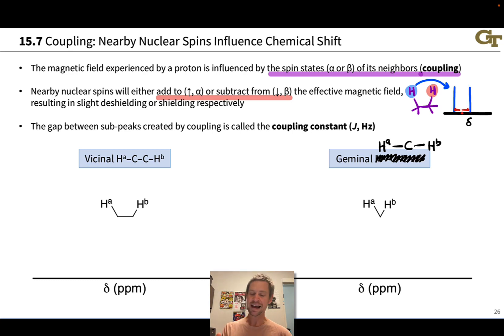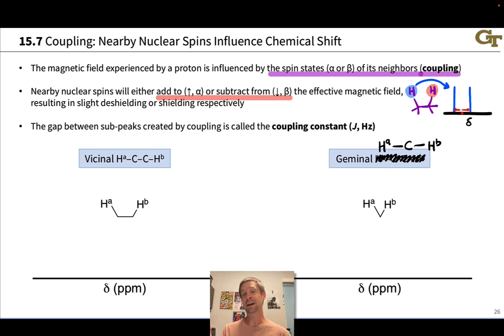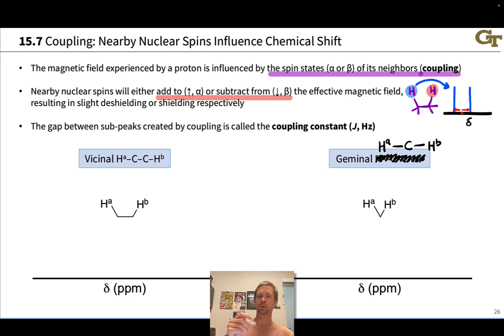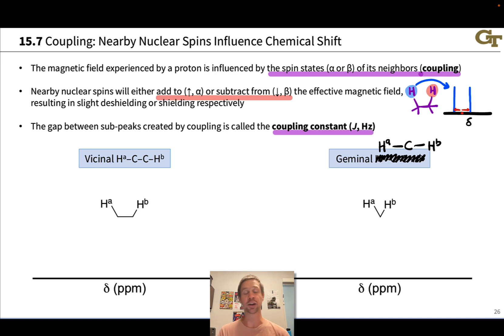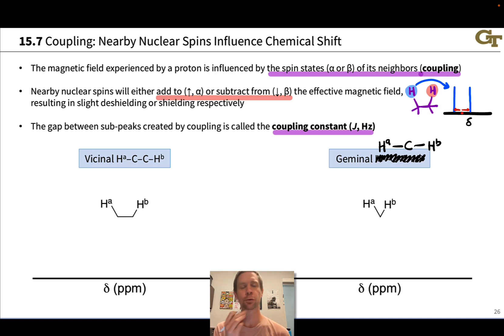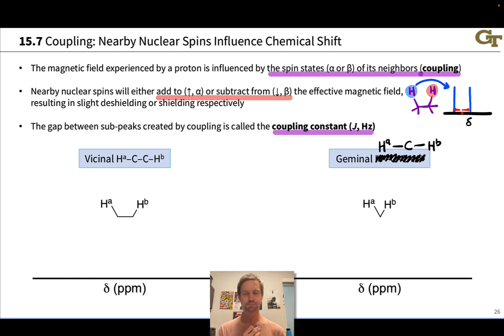This gap between the subpeaks has a frequency value in hertz corresponding to the gap in frequency between the two peaks. This is what's known as the coupling constant J, and it's measured in units of hertz for reasons we'll touch on in a moment.